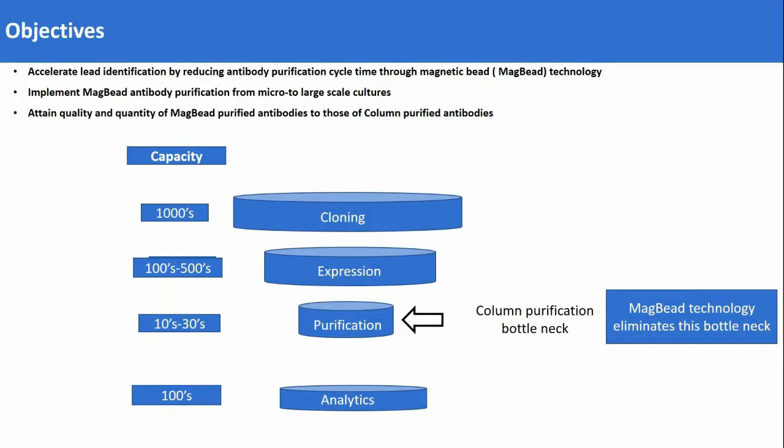So the reason why we're going into this is that purification of antibodies is a labor-intensive process. It costs a lot of money because of the upstream clearance before the samples are loaded on the column in terms of the traditional methods. But with the paramagnetic beads, we can go directly into the crude cell culture with the cells and then just load the samples on the beads, separate the beads with the magnet, and what we have is our ligand on the beads, and just wash the beads and eventually take off the protein.